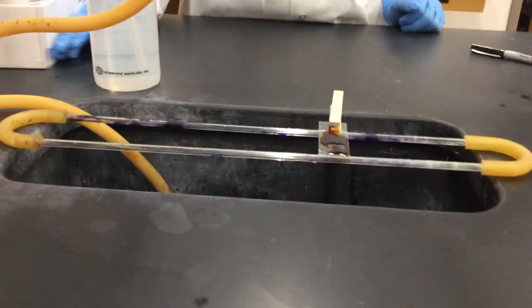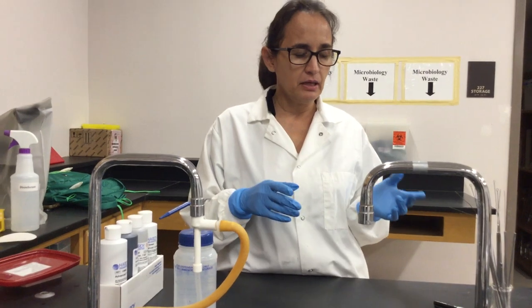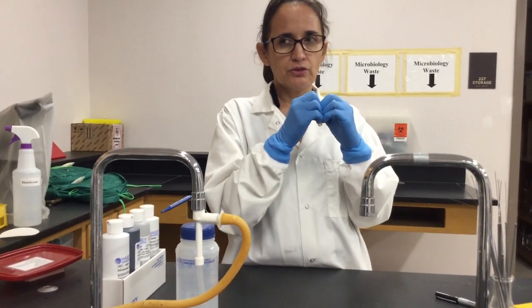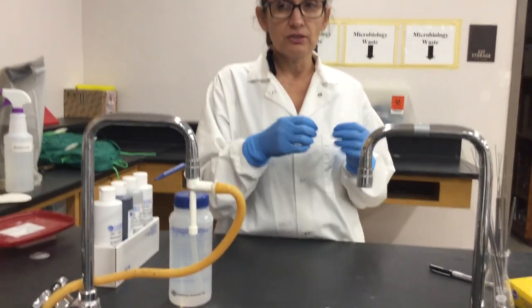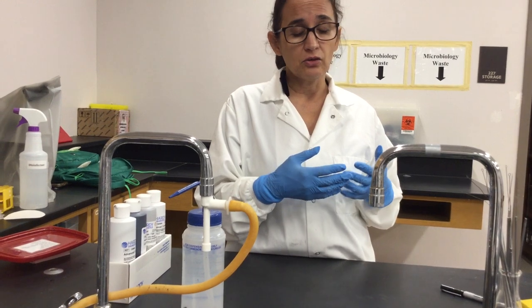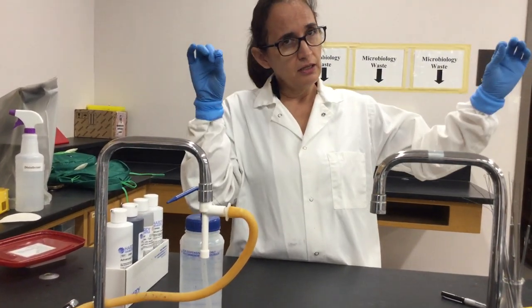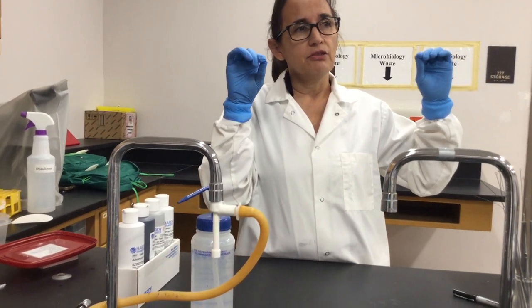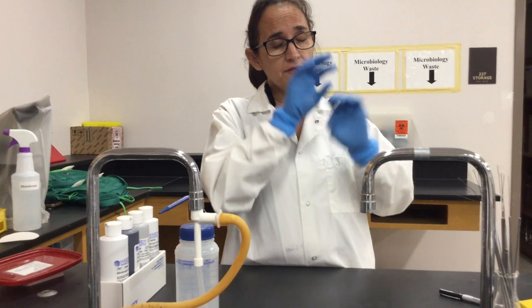So cocci can be single, which rarely happens, but it can be, or they can form groups of two, which you call diplococcus. Diplo means two. They can form tetrads, groups of four. They can form groups of eight that are called sarcinae. And some of them can form a long chain, which is called streptococci. Strepto means chain.